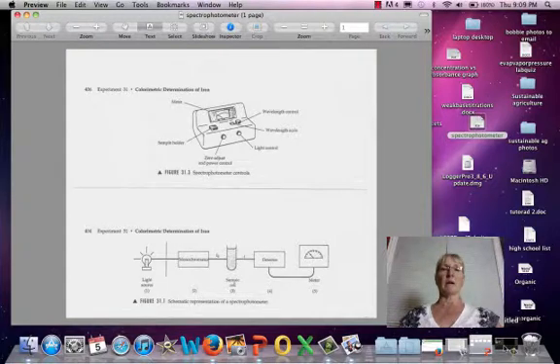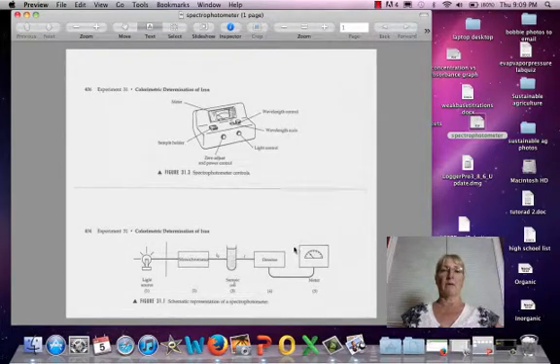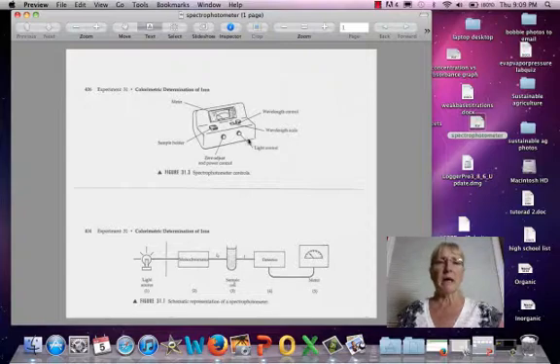I did want to talk about what you can see here on this one image that I scanned in of an actual spectrophotometer. Now, our colorimeter, we had spectrophotometers, I just used the colorimeters because they're a little simpler. I think they mimic what happens in this original big box. So the thing that you're seeing here is called a spectrophotometer. There's actually some stored in the classroom, and it consists of a place for you to put your cuvette, a place to adjust things like the amount of light and the wavelength, and you can read off of this analog dial here what the absorbance is.